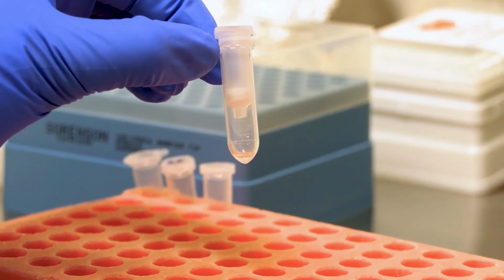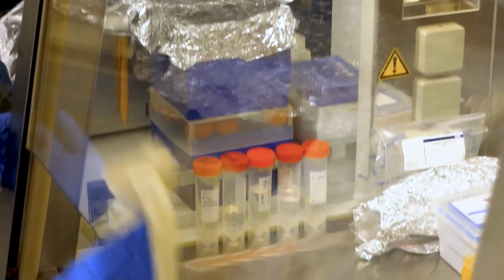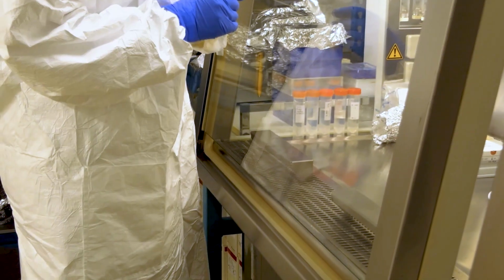After you have finally retrieved your DNA extract, clean all hoods you used and tools which you may have touched at any point during your work to minimize possible cross-contamination between projects and samples. Switch on the UV light in the hoods.